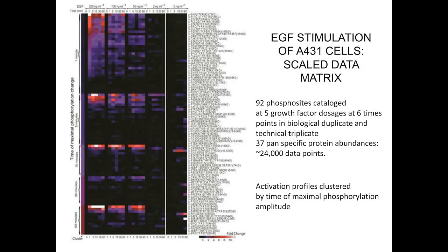And how also would they respond to differences in growth factor signaling networks, or different growth factor signaling levels? So this is a very busy slide, and I apologize for that, but we were quite proud at the time of the ability to track so many modification states of important signaling network proteins. And that's what I show on the right of the chart, all of the different phosphorylation states that we were following at the same time.